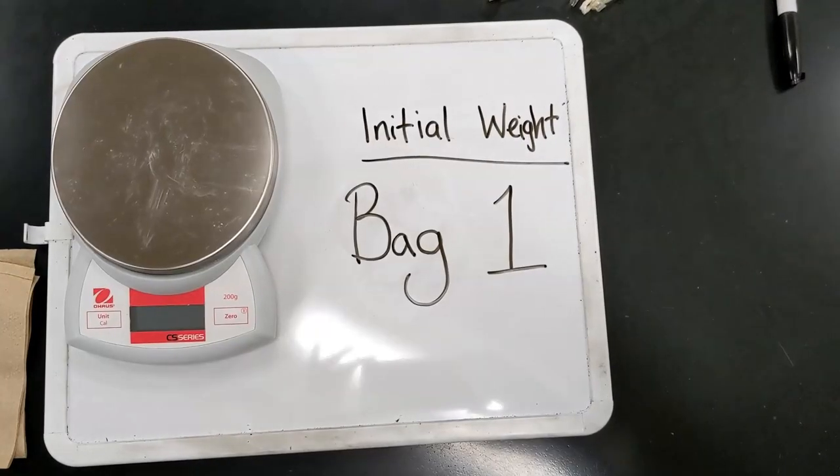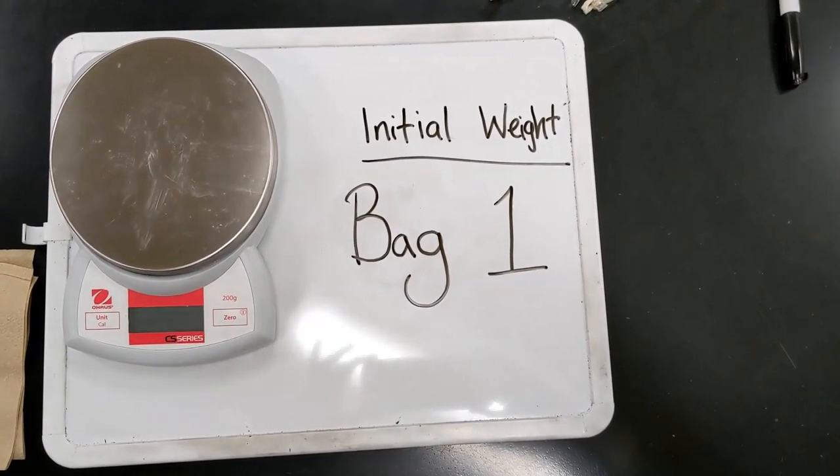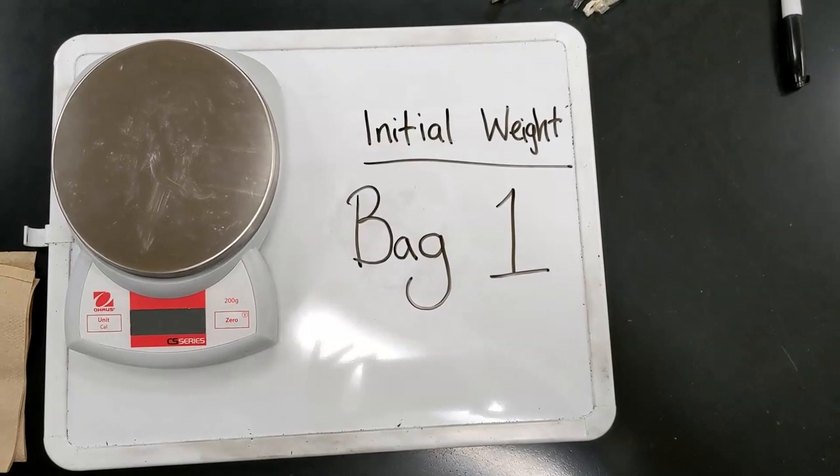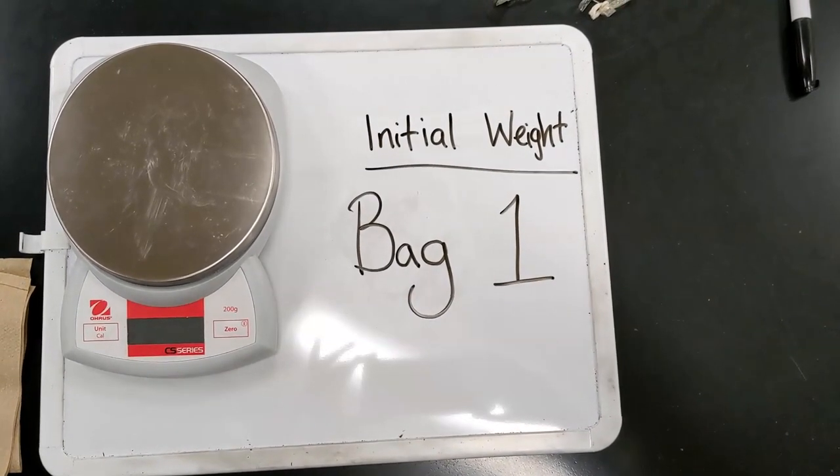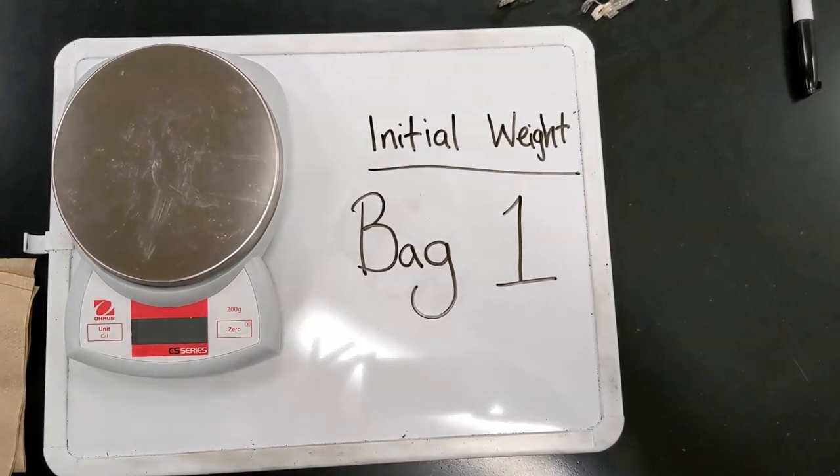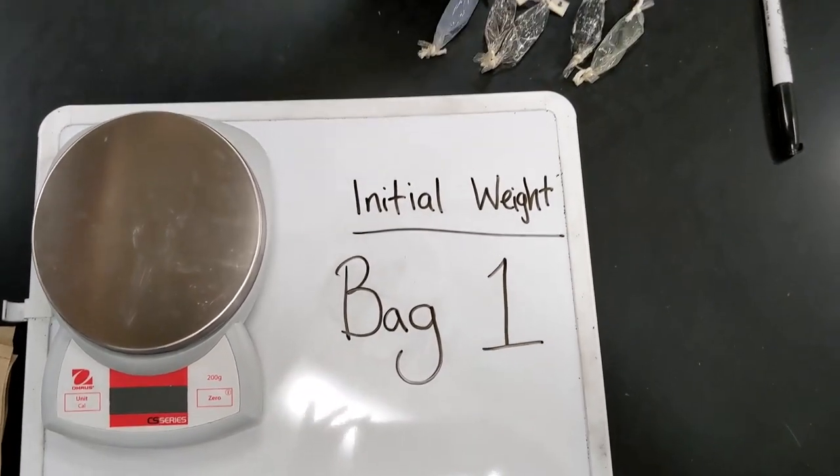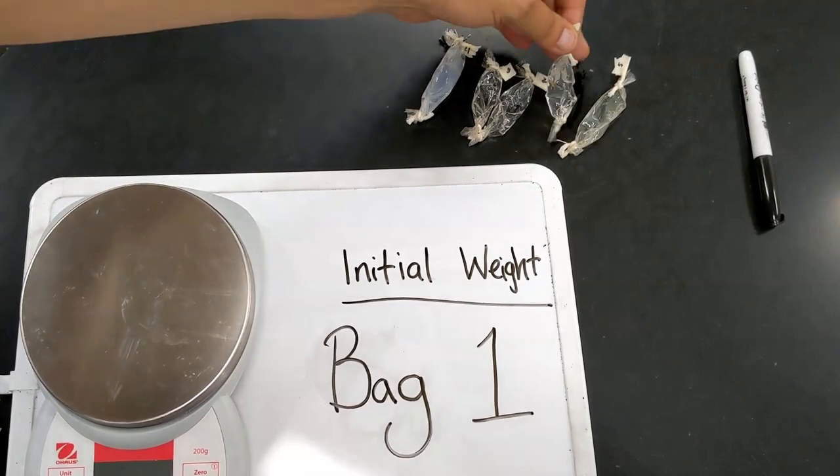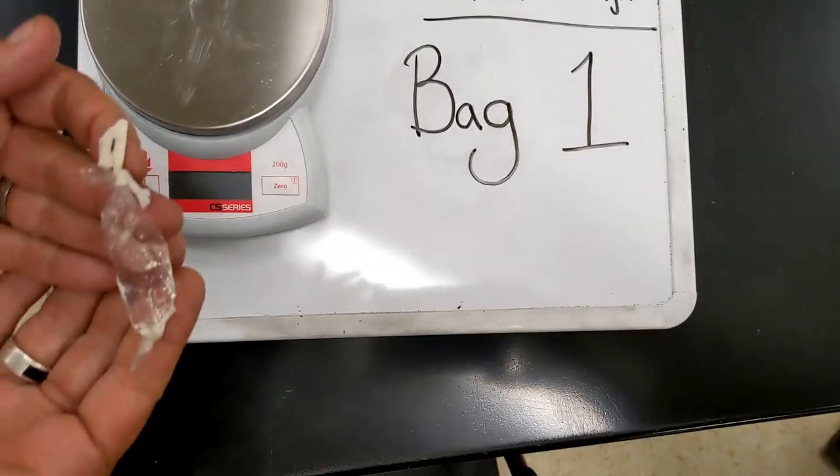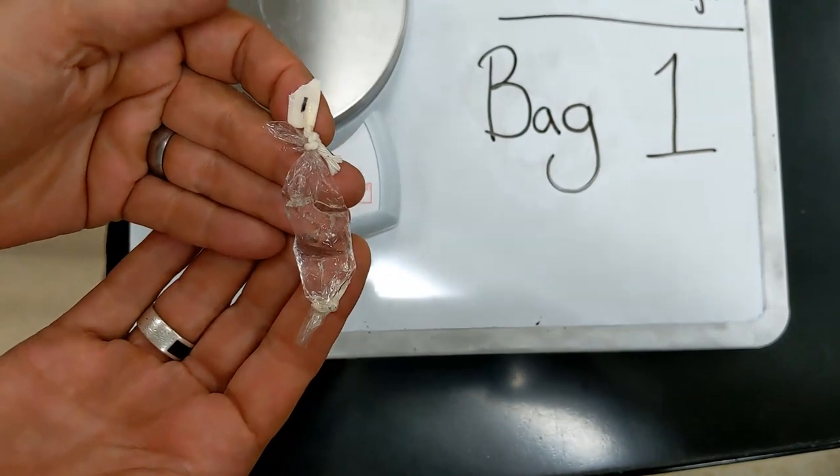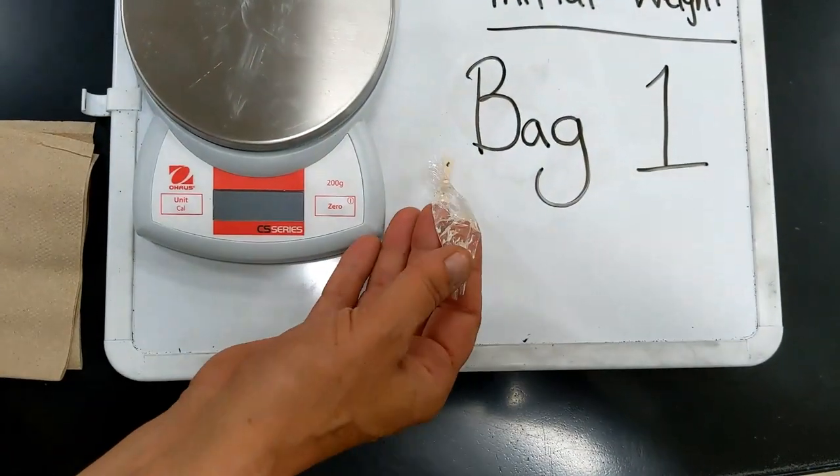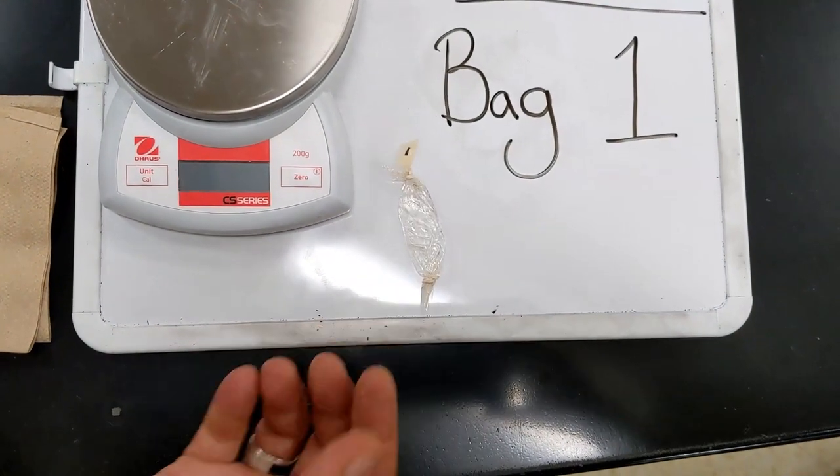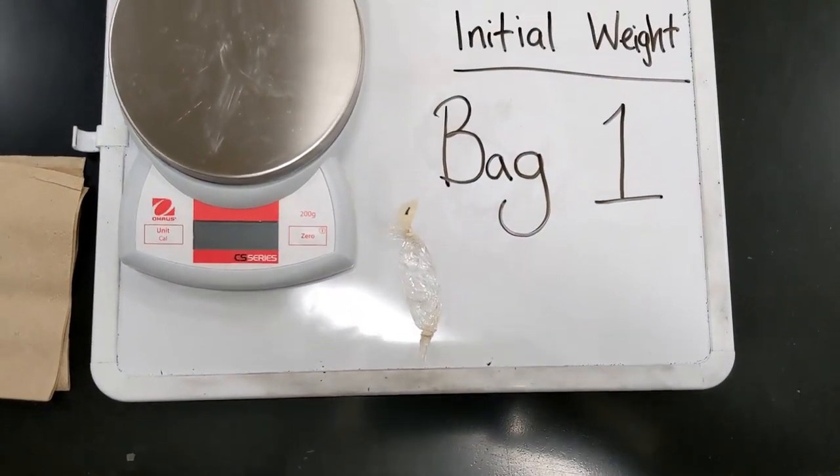So the next part of the procedure, we will demonstrate how you will weigh the bags, and I will show you this with example bag one. We have taken the bags and we have wet them, including the strings, so that when we weigh them intermittently, we don't have the dry weight discrepancy of the strings.